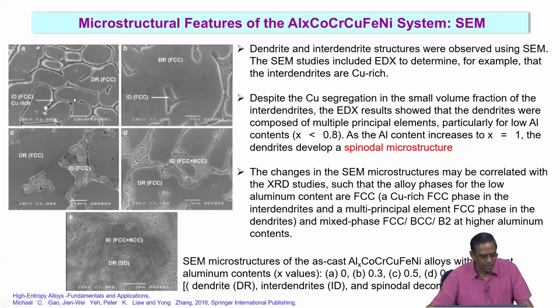There are a lot of annotations on the micrograph. DR stands for dendrite, ID stands for interdendrite, and SD stands for spinodal decomposition.